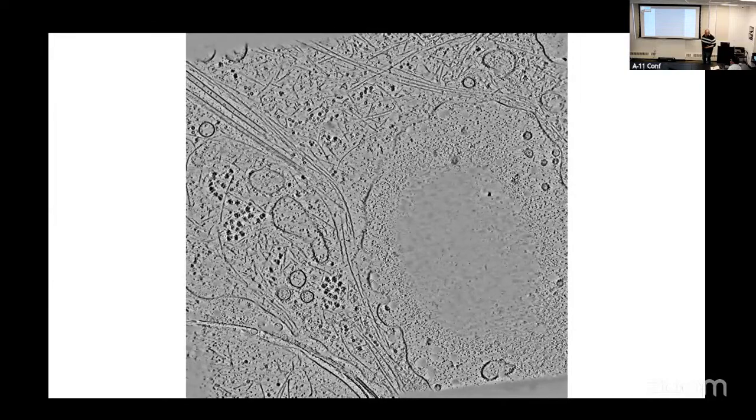For things like particle picking and just finding things that you need to find in your tomogram, it actually even preserves pretty good high resolution information. These are cofilactin filaments running through right here, and this is a bare actin filament. I don't know if you can see the two different twists in those filaments. You can still tell what's what. And actually, we're still working on this, but doing this kind of denoising prior to segmentation can be really helpful if you have the right network.